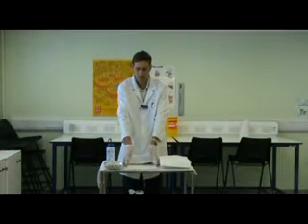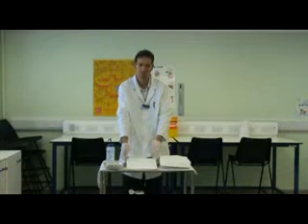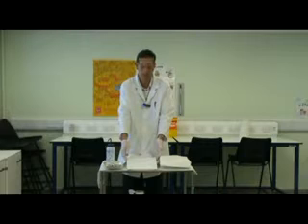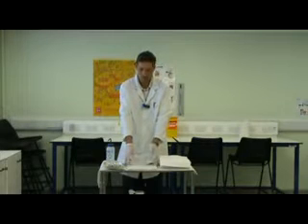Here in the front is a ceramic tile that is very useful for placing an organ on when observing it and dissecting it. We also need the water, which we'll spray on the organ in order to prevent it from drying out.